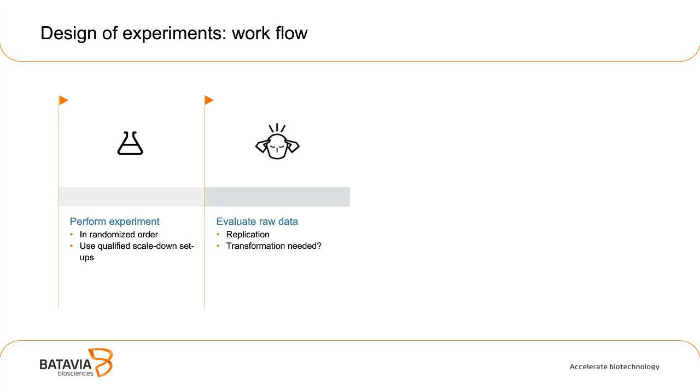Then you have performed the experiment, and then you have to evaluate your data. And of course, everyone wants to model the data. You want to describe your data with a model. But it's good to first just look at your data. How is your data looking?